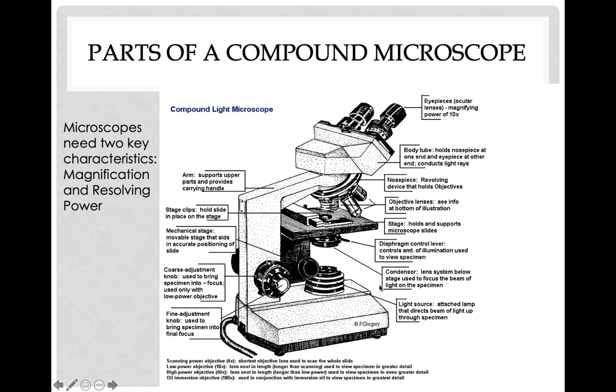Things may be in a little different position, or they may move a little differently, but they're all basically the same. Like the on and off switch, or maybe the light adjustment things may move around from place to place, or maybe be on the side or something, but the microscopes all basically are the same. So anyway, top down, eyepieces.